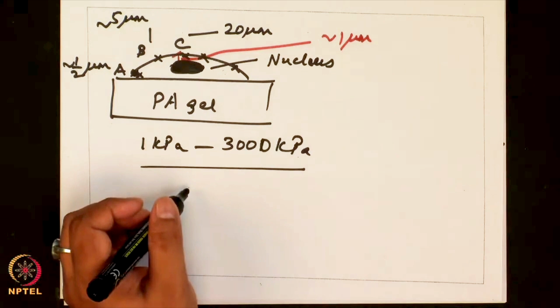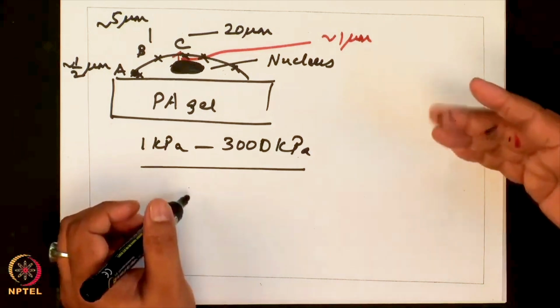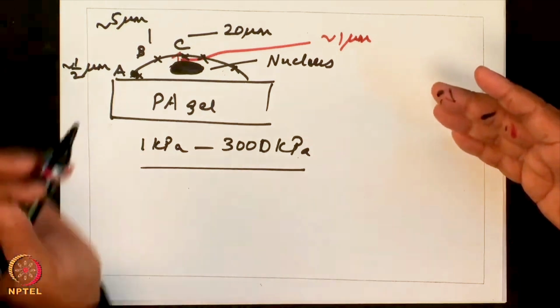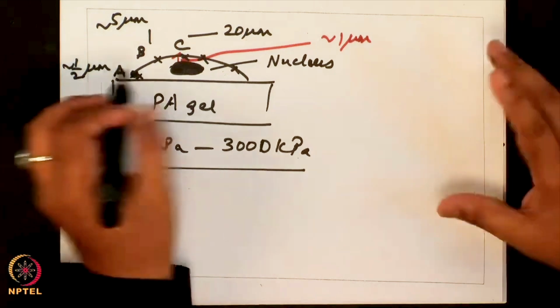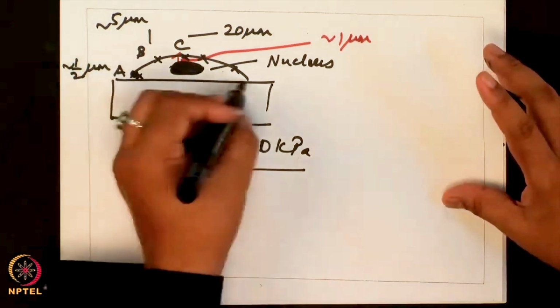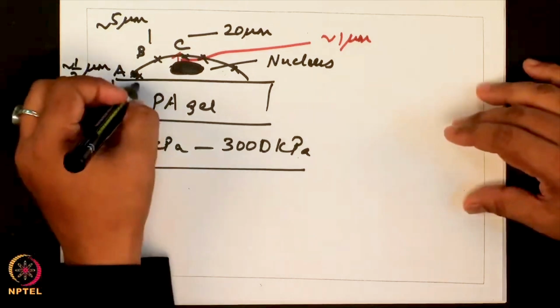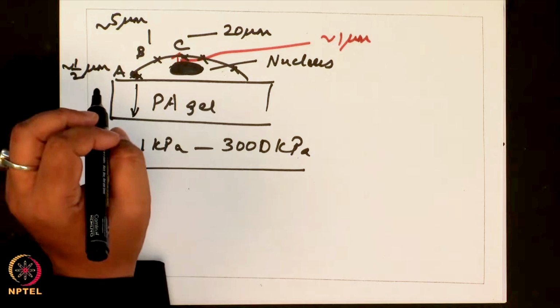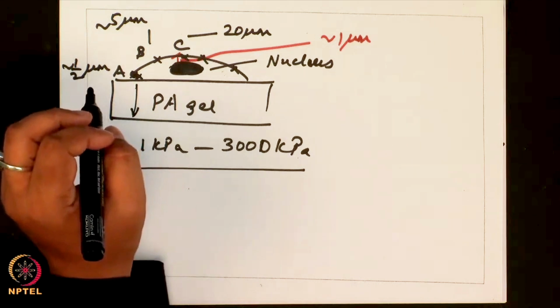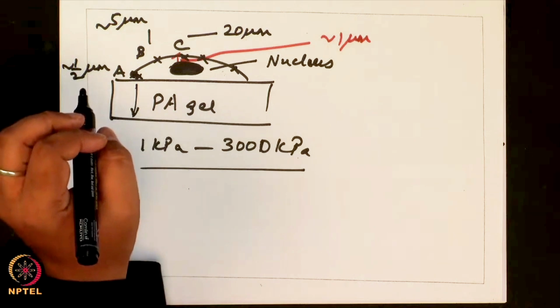Does it make sense? This is where you have to be wary about the assumptions of the model, which assumed that your sample is a semi-infinite half space, which means that it does not have finite width in this direction, but it is infinitely wide, and along the thickness axis also it is infinitely thick. So, these are the artifacts. What are the factors that contribute?